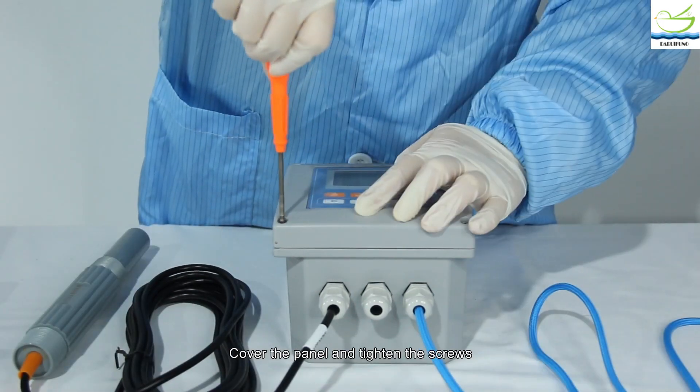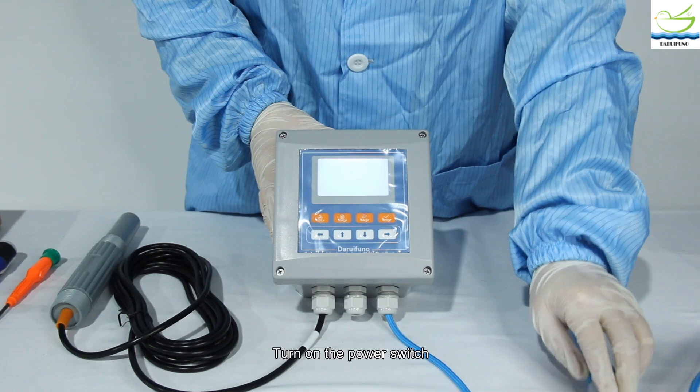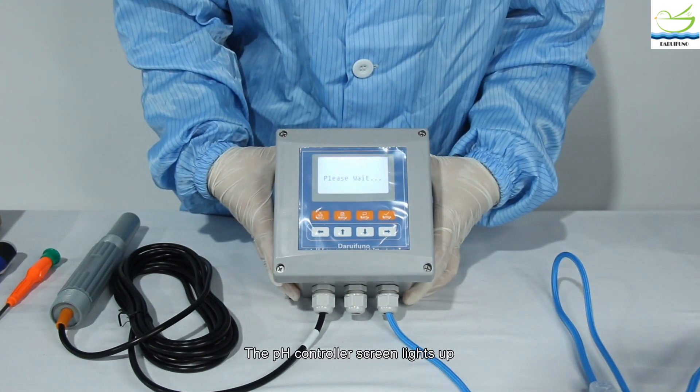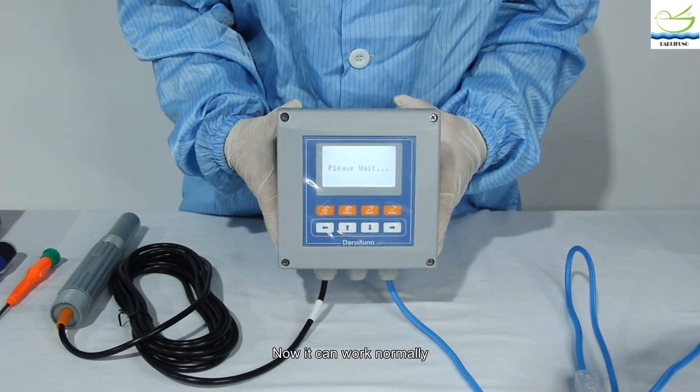Cover the panel and tighten the screws. Turn on the power switch. The pH controller screen lights up. Now it can work normally.